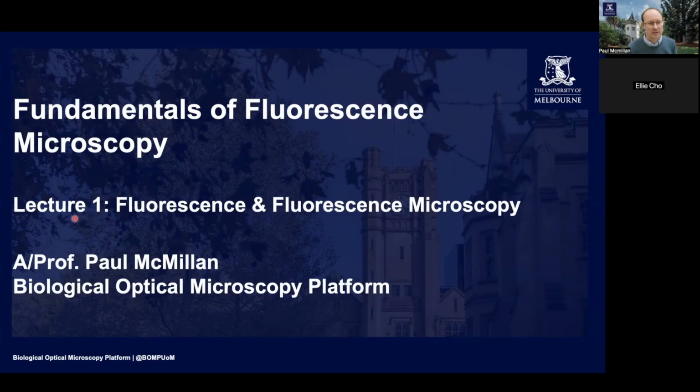So this is a webinar series of three different webinars. We'll go through different content in each of those. If you have any questions at any point, feel free to use the Q&A chat function to post those questions. I will answer them at the end of the webinar. Otherwise, you can put your hand up and I can unmute you if you're brave enough to ask a question online. So today's lecture, we're going to look at fluorescence and fluorescence microscopy applications.